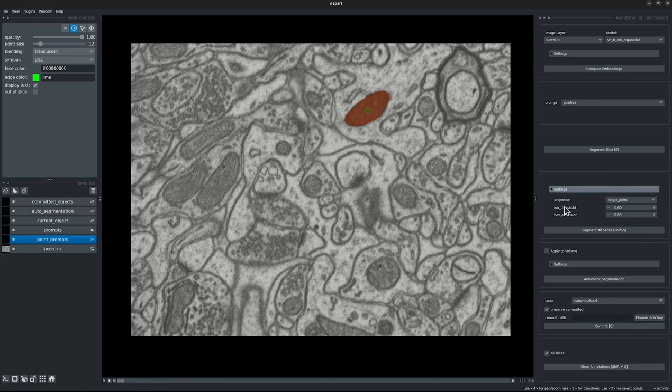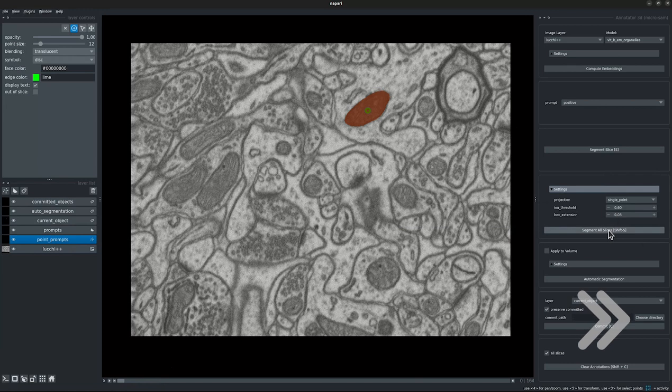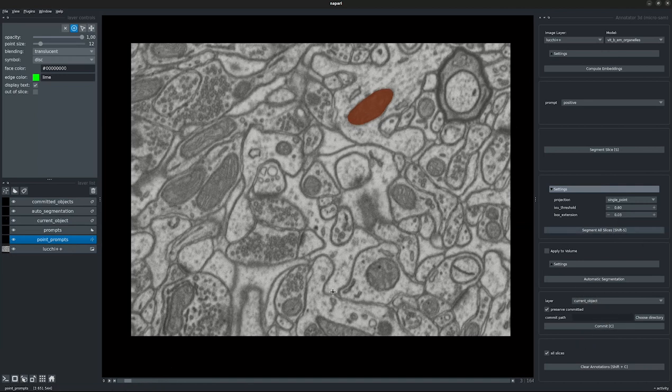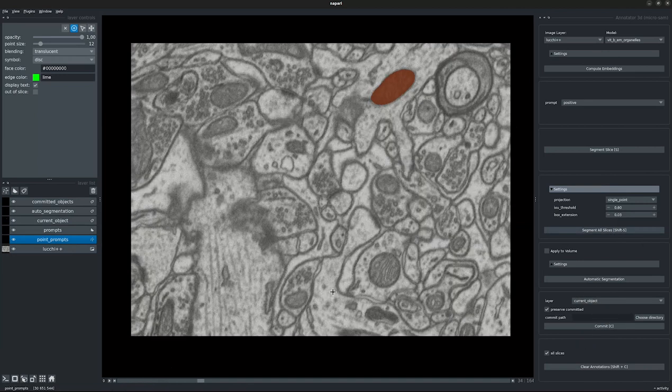The next parameter is the IOU threshold, which is the criterion for stopping projection of segmentations by comparing the quality of segmentation for adjacent slices. The box extension parameter is the factor by which the box prompts are increased, to account for the possible change of object sizes in adjacent slices. And there we see the object has been segmented along all the slices.